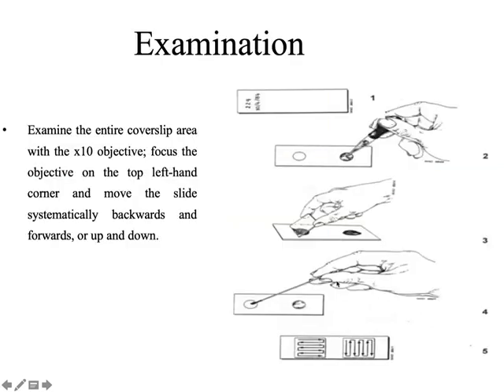Okay. Here is the examination. How can we examine the direct? For example, I have a stool here and I have a specimen here. How can I examine it under the microscope? So under the microscope, after preparing everything, for example, here you have kept the iodine stain, okay, and you have mixed it with your sample and you have separated. This is iodine and this is uniodinized, okay.